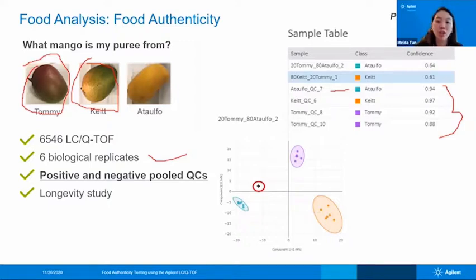Can you get confidence score? Yes, we have done this. When we created this mango experiment, I also have a couple of experiments from honey. Those samples were from Indonesia also. So we did this analysis for the honey testing to make sure that unknown samples will fit into it. And for the current experiment, we did this on the mango, and it worked very nicely. As I said, we have different QCs available with 20, 80, 90, 20, and with that we should be able to see where exactly it fits.